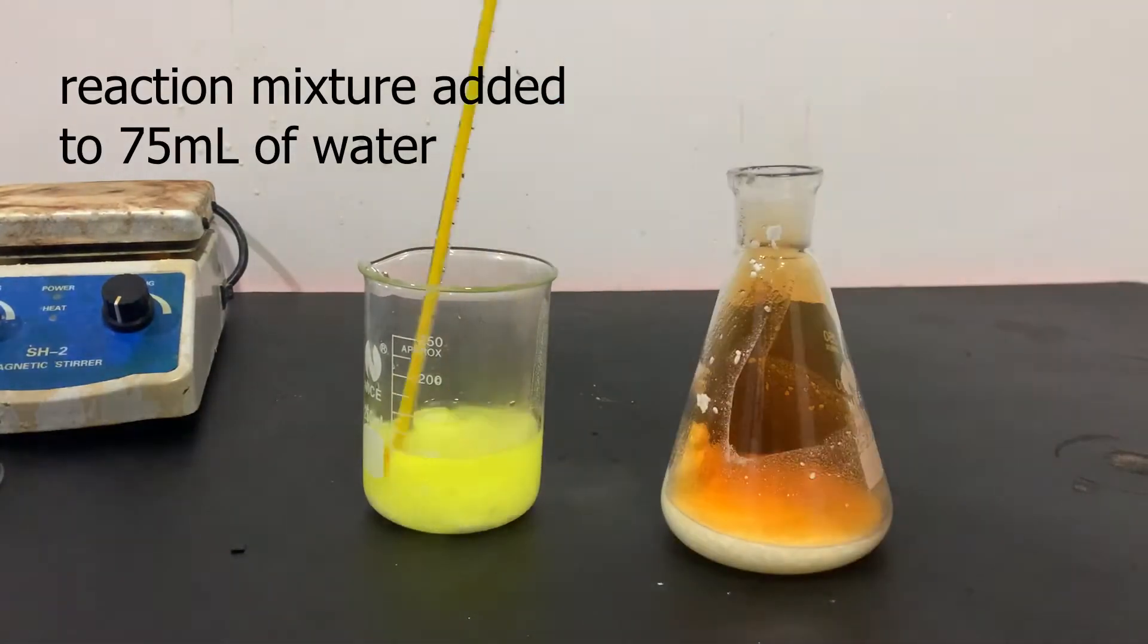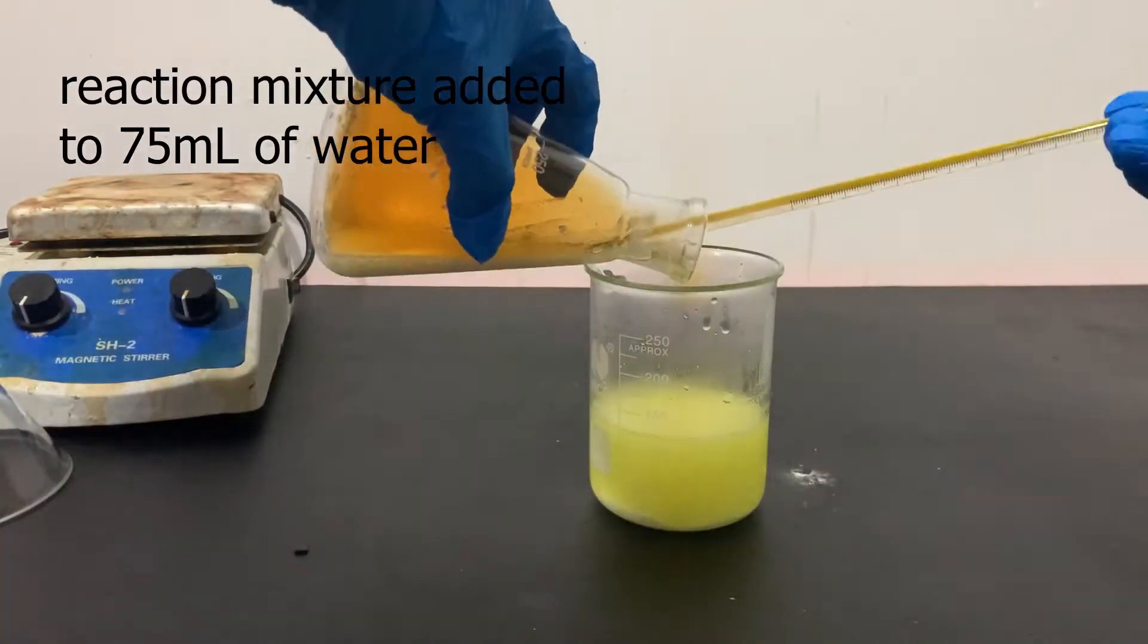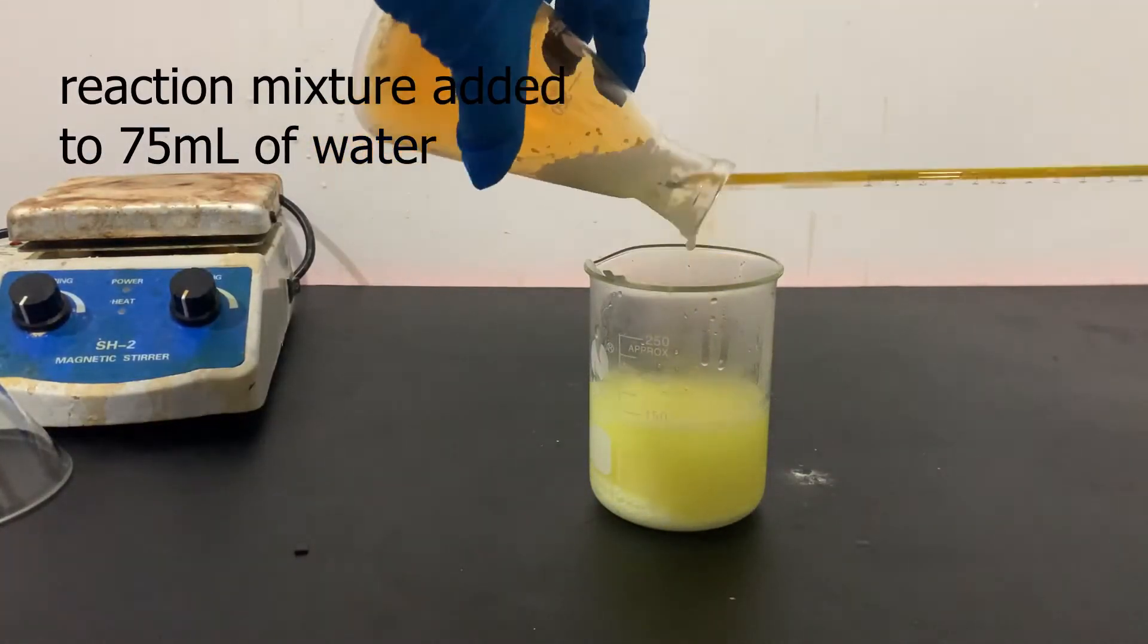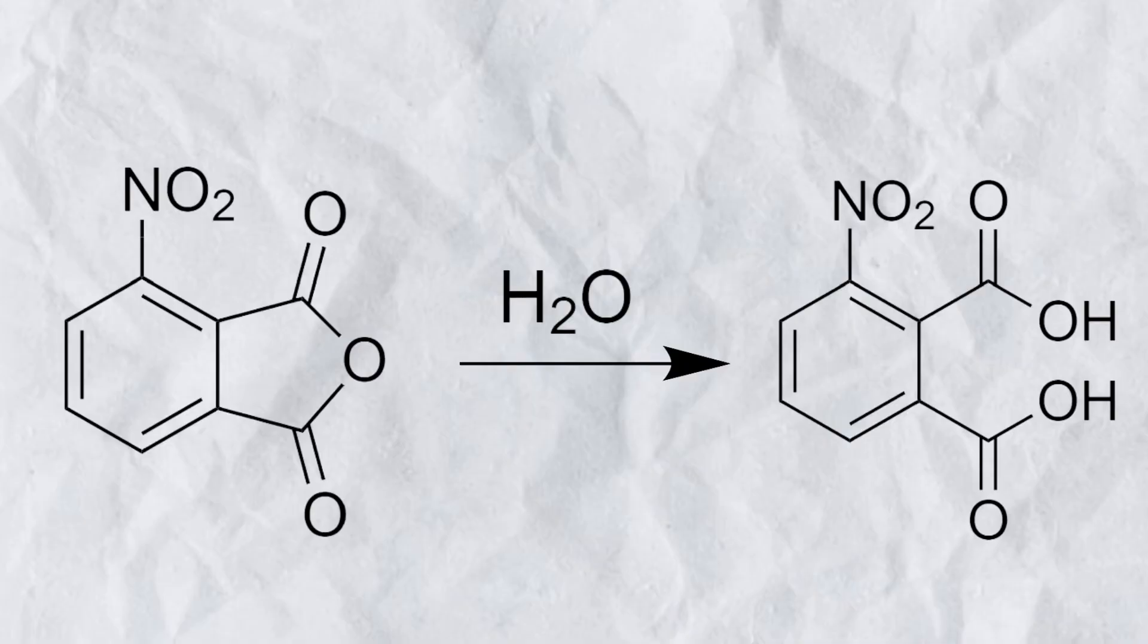After two hours, I let the flask cool down and then add it to 75 milliliters of water. When 3-nitrophthalic anhydride is added to water, it hydrolyzes to 3-nitrophthalic acid.